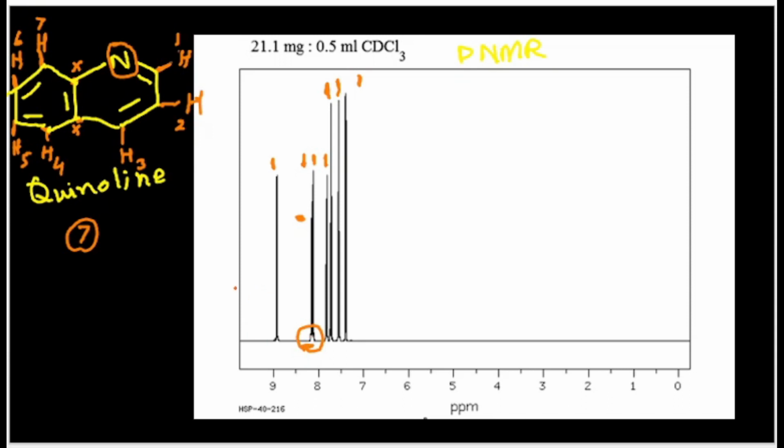So now the problem is that we have to find the quinoline structure from these values. How do we find that this is the structure of quinoline? If you see here, this is the 7th chemical shift value, and this is the 9th chemical shift value. But benzene will always show 7 to almost 8.4 or 8.3, or in some books a 7 to 8 range of chemical shift value.